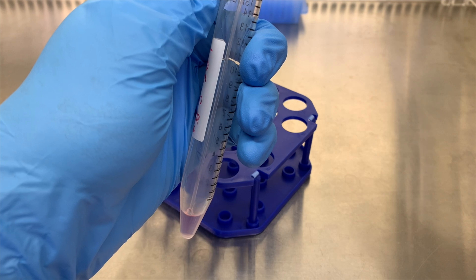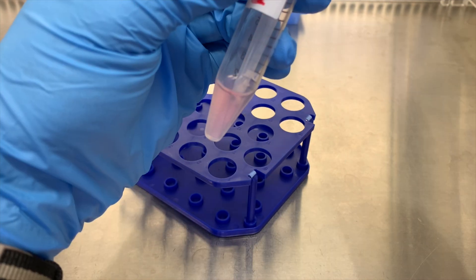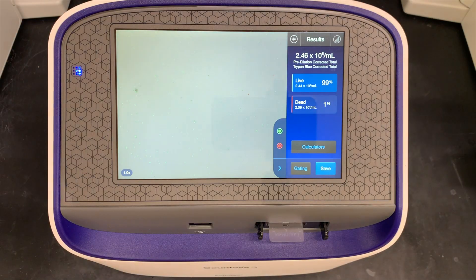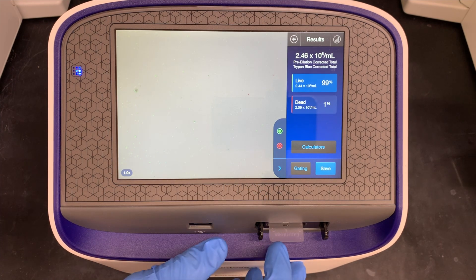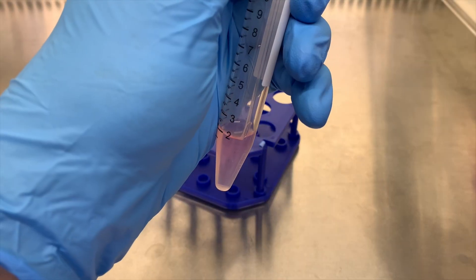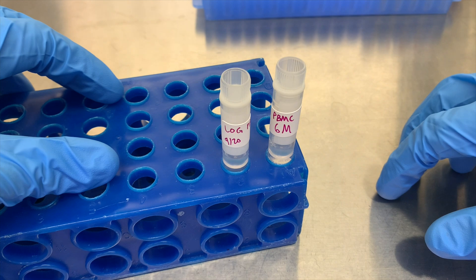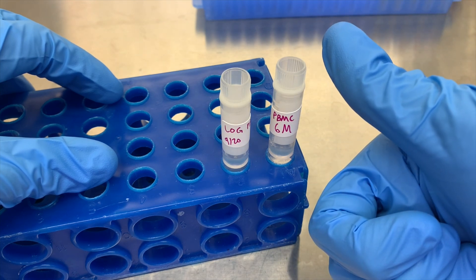I'll give it one more wash with media just to remove any residual RBC lysis — spin and aspirate — and then we're good to keep going like normal. And if you're worried about whether all of that would kill off cells, PBMCs are usually more hardy than you might expect. Let's resuspend this in 5 ml media to count — stain it, load it, and there we are: 2.44 million cells per ml, about 12 ml total, 99% viability. Just fine. And then from there we can finish processing like normal. I'll give you a reminder to give the PBMCs 10 minutes in the 4°C fridge before putting them in the minus 80 — people sometimes ignore or forget about that step.